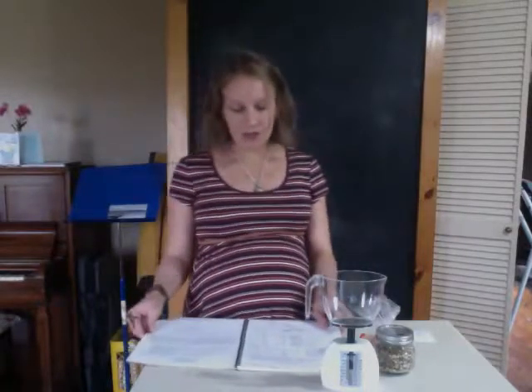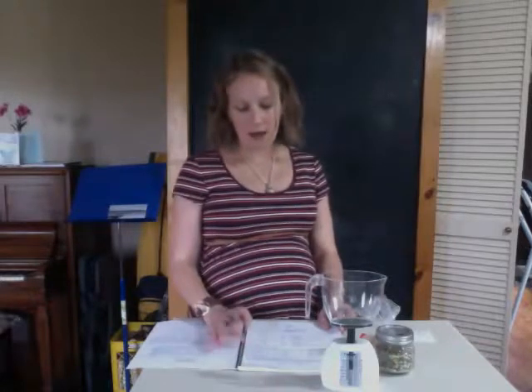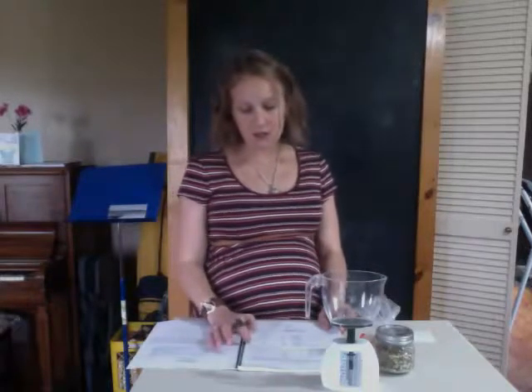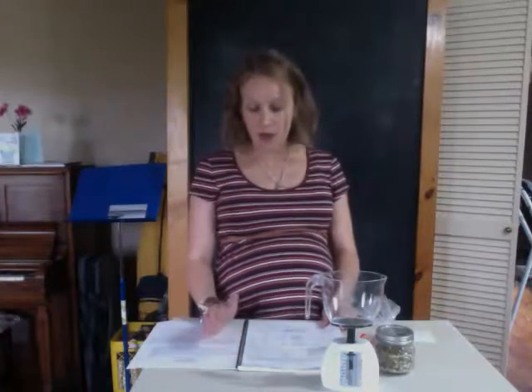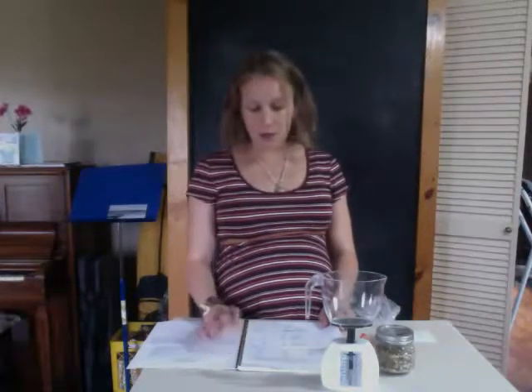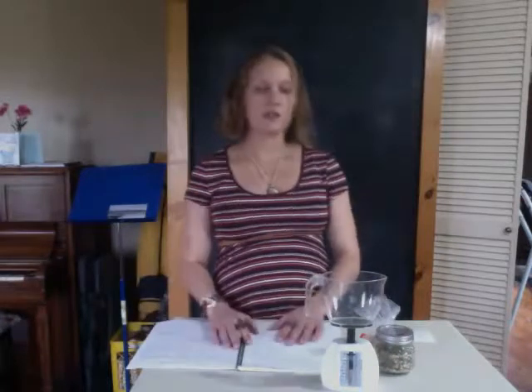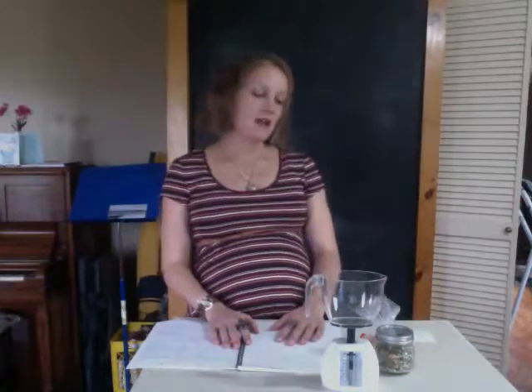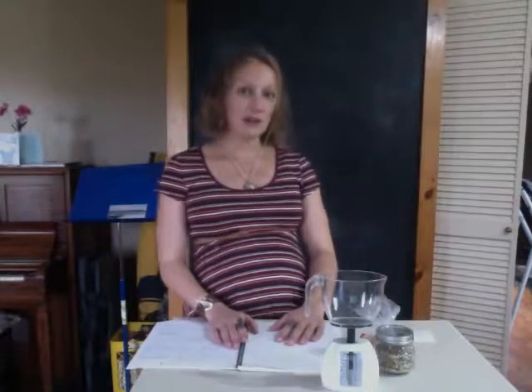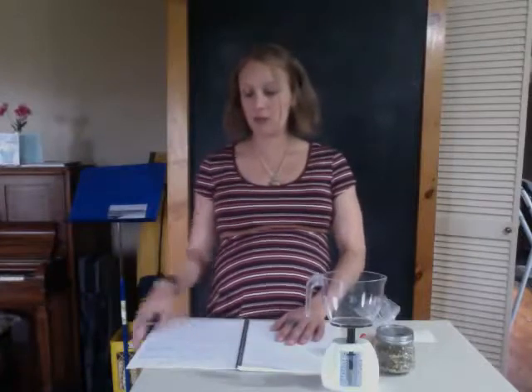So you see some examples in your copy of finding averages and average deviations of water samples for water hardness, and they give you a good explanation of how they determined whether or not the two samples were different from each other. So your assignment for this lab is to choose 2 samples from your kitchen or from your house that by looking at them you can't quite tell if they have a significantly different mass from one another.